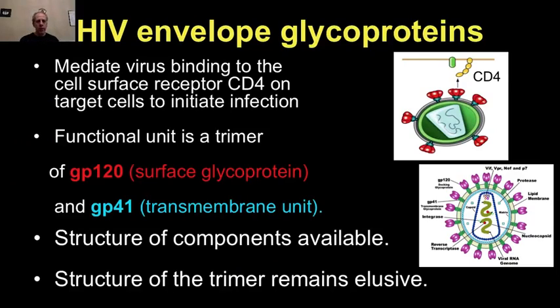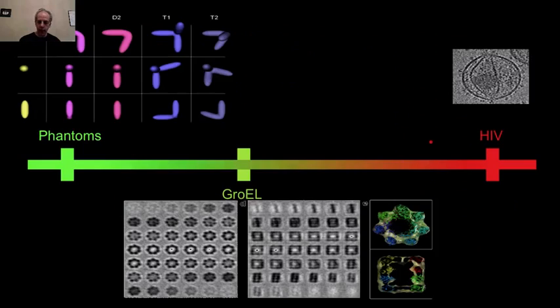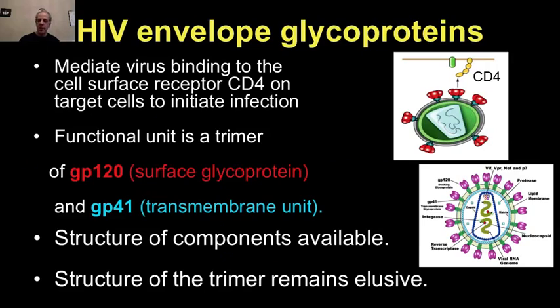Now, let me reiterate to you why this is so important in this schematic. These are what we have been seeing. Let me show that again. This is basically a true example from this cryotomography, one slice. And now this is a schematic of that.